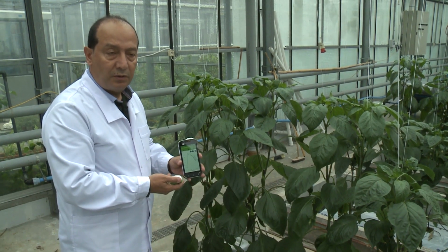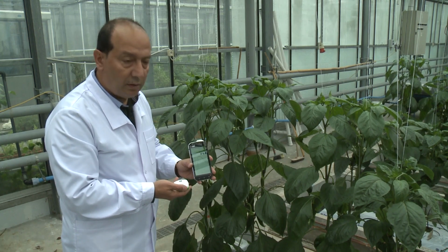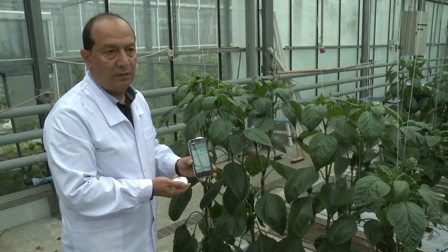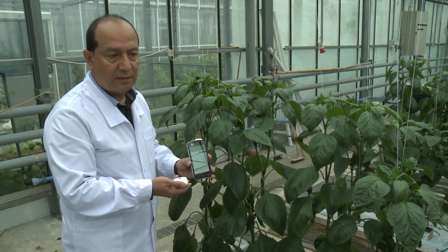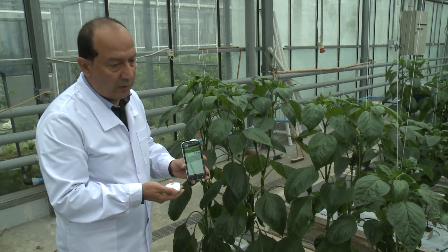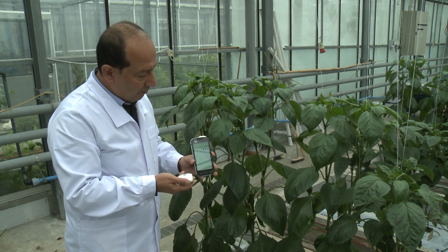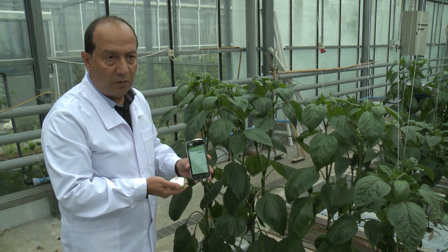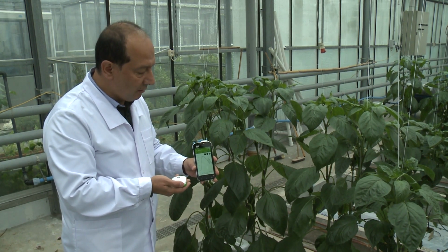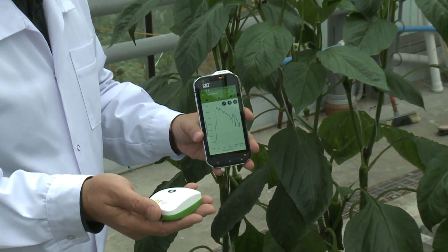The next instrument which I would like to show you today is related to light quality analysis. As we saw with the other light sensors, they can give us the light intensity in certain wavelengths, mostly used in plant sciences is the photosynthetically active radiation between 400 and 700 nanometers. And as we said, we can get the values either in micromole photon per meter square, or in micro-Einstein. But the new generation of these light sensors allows us to give the light intensity in many units at once, and at the same time, as you can see here on the screen, it can analyze the light quality. So we know about the light intensity in certain wavelengths.